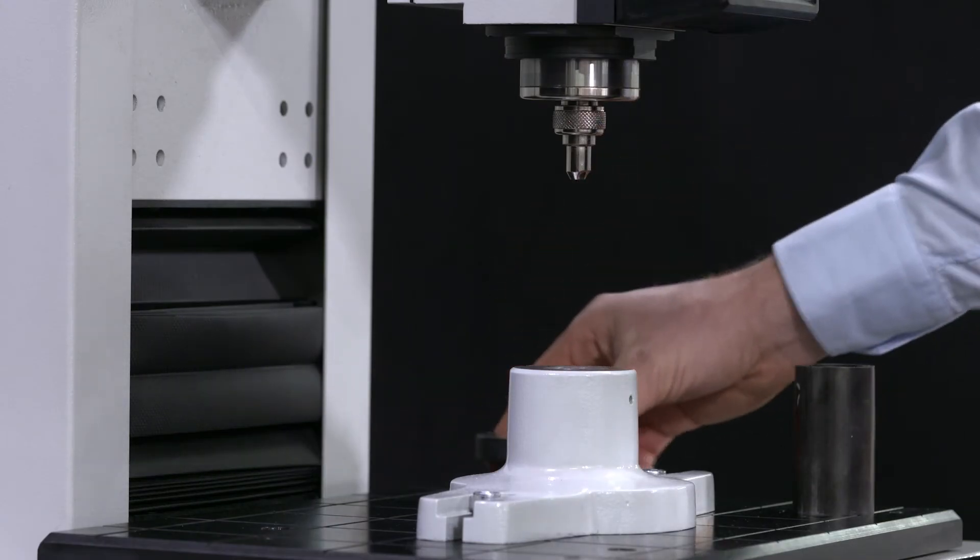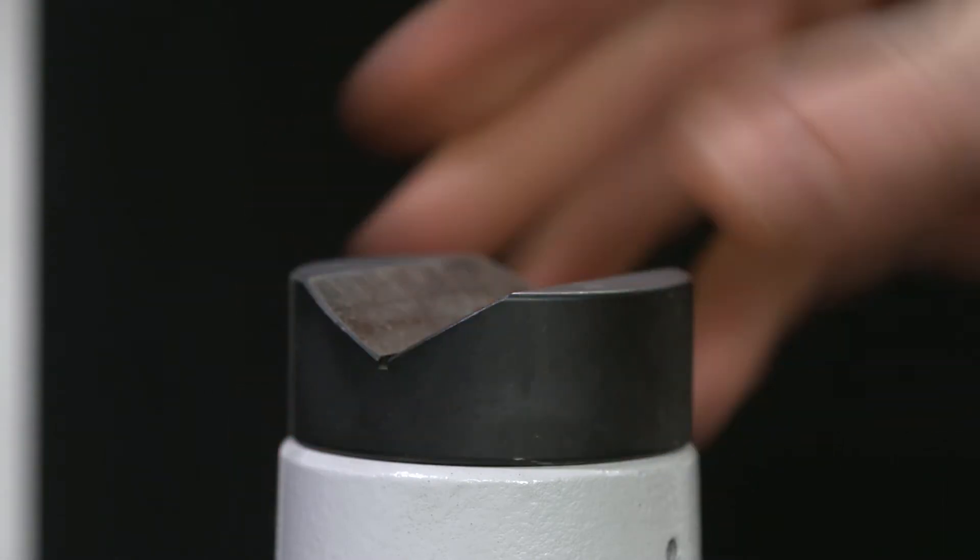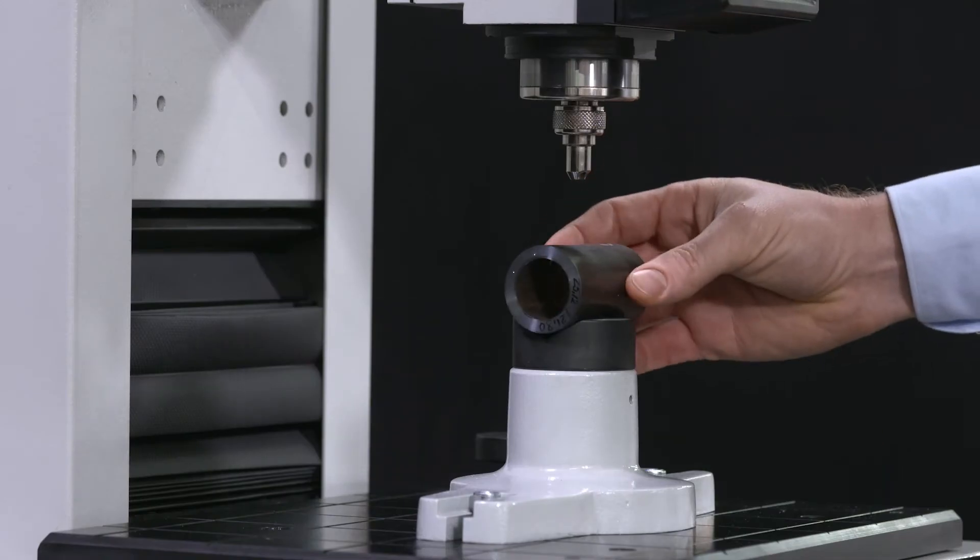The test width and height are fully configurable based on the size and geometry of the piece to be tested.